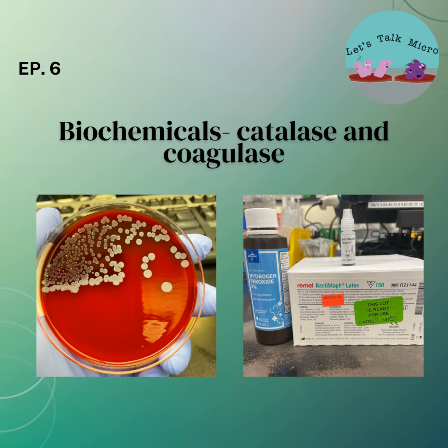So that 40X is a very helpful tool. It points you in that direction. It can make your job easier. Like I said, the urine bench, alpha colonies, long thin rods, lactobacillus, I'm done. White colonies, coryneform gram-positive rods, okay, skin flora, urogenital flora, I'm done. So it's a very helpful tool to have in the lab. And just remember with the 40X, your condenser and your light need to be down, as opposed to your 100X. With your 100X, condenser and light need to be up.